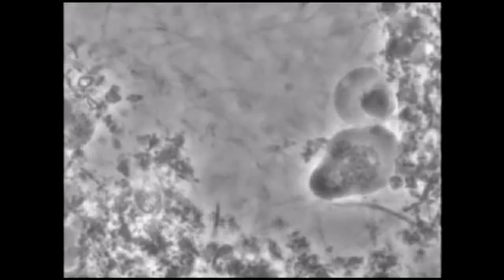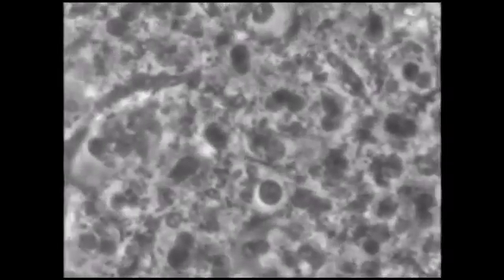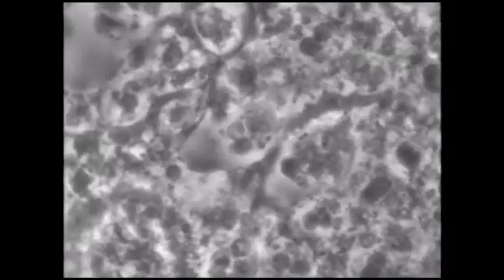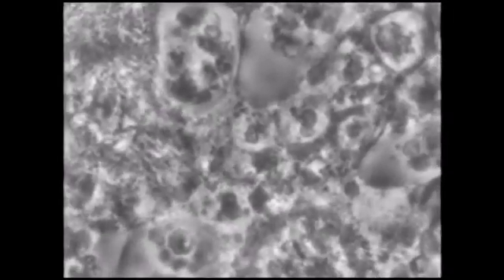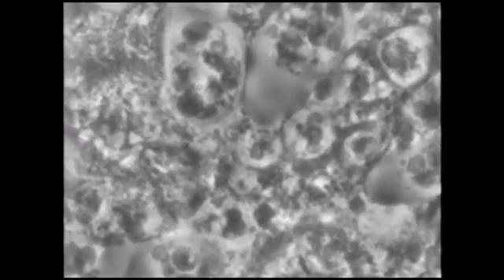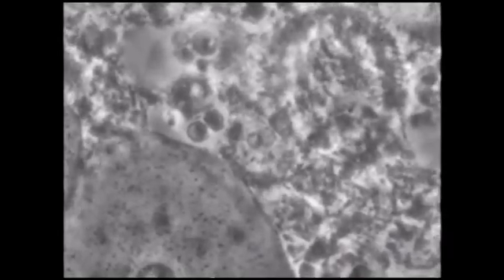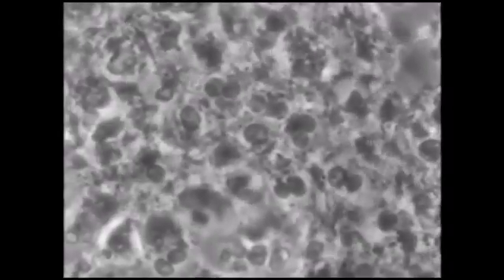There is a large gathering of amoebas: four, five, six, seven, eight. You see one moving on the lower left, and many small gliding rods and spirochetes in the background. These amoebas are surrounded by a mat of white blood cells, as is often the case. They produce tremendous amounts of inflammation. The presence of amoeba in large quantities of white blood cells makes the classification of this disease as advanced as it gets.